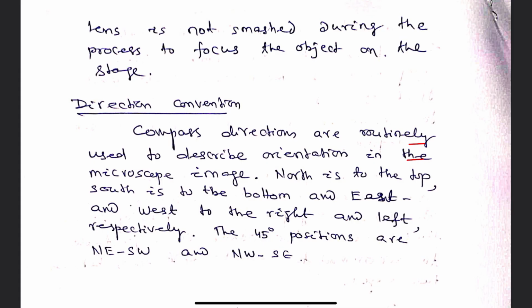And finally, if we use the conoscopic arrangement to focus the mineral on the stage, cones of light rays are supplied into the stage of the microscope, and an interference figure is produced. That figure is mostly used to study the optical sign of the minerals, whether it is uniaxial positive, uniaxial negative, or biaxial positive, biaxial negative. So figures are obtained through the conoscopic arrangement.